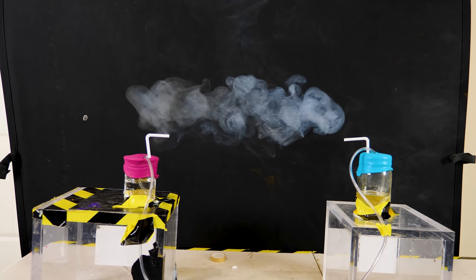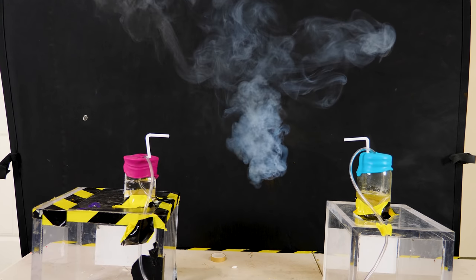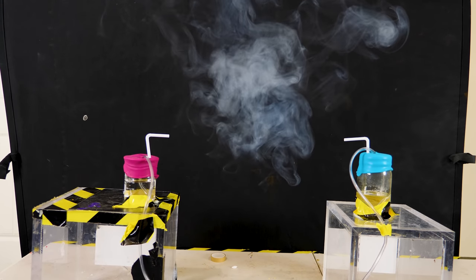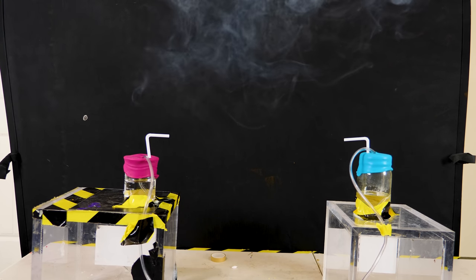Now you can kind of see a little bit of smoke come out of the hydrogen chloride bottle, even without the ammonia. But that's due to not actually seeing the hydrogen chloride. What you're actually seeing is tiny little water droplets mixed with the hydrogen chloride.